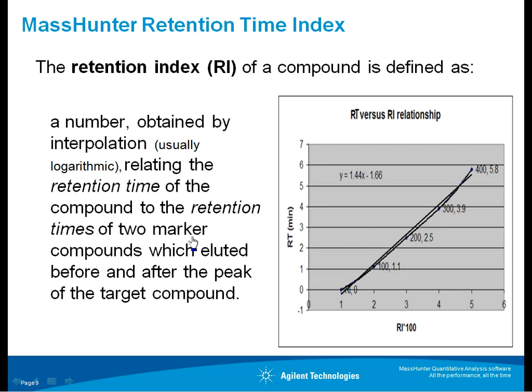So our goal here is to use these retention time indices to enable what I'll say is retention time normalization. The trick being, create this relationship, this mapping between retention indices and retention time, allowing this time correction. So with this updated mapping again, you can locate a compound in the library, and if the library stores the retention indices, and you've created this mapping with the retention time calibration tool, which I'm about to show you, you can then use retention indices as an additional constraint on that library search.